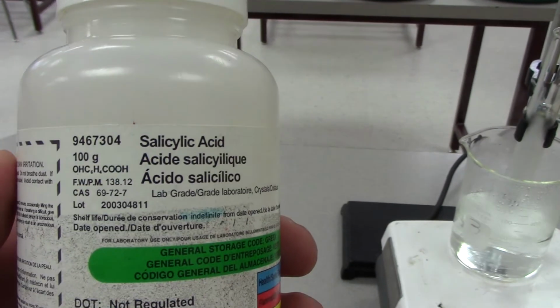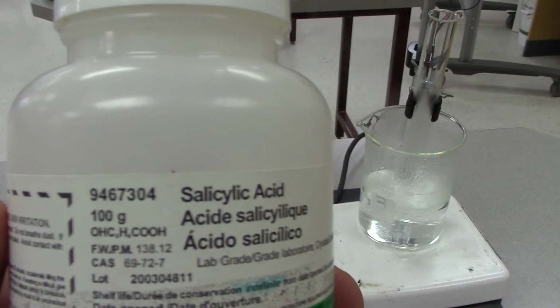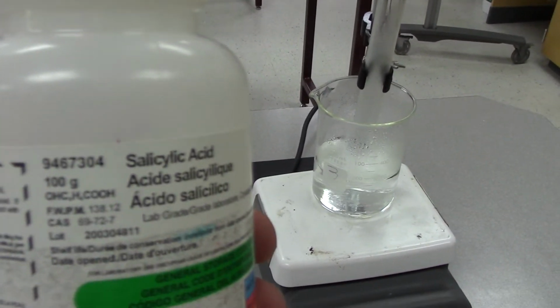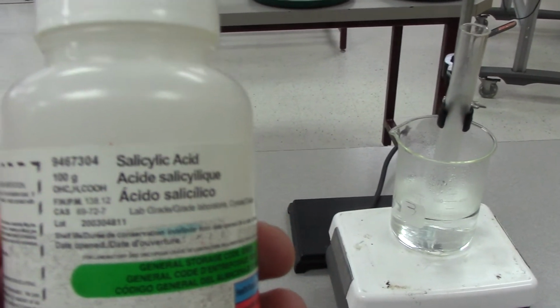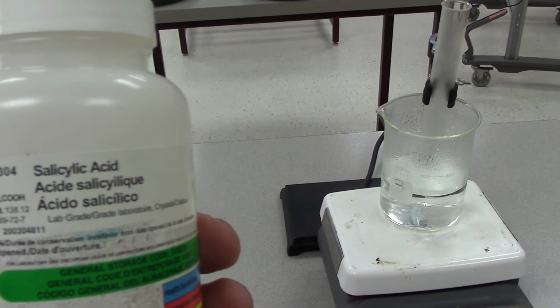There's your chemical formula, but like I said, you'll have to look up what the structure looks like online. It's OHC6H4COOH. I'm going to measure half a gram out of this on a weigh boat.